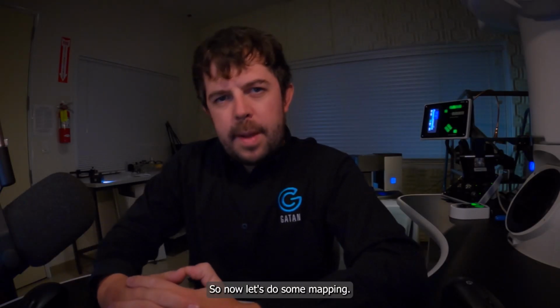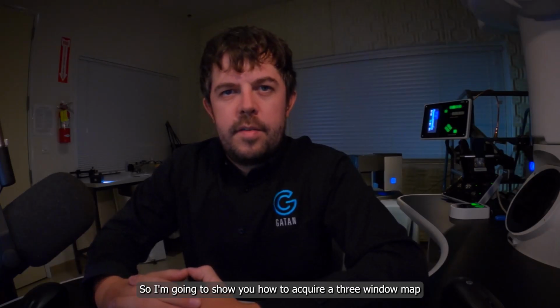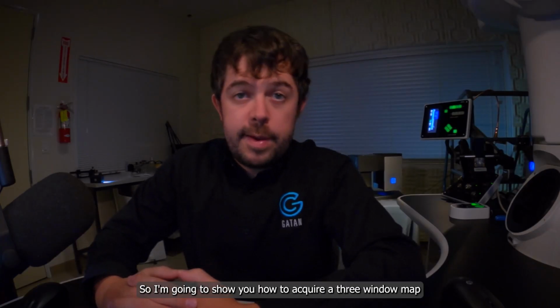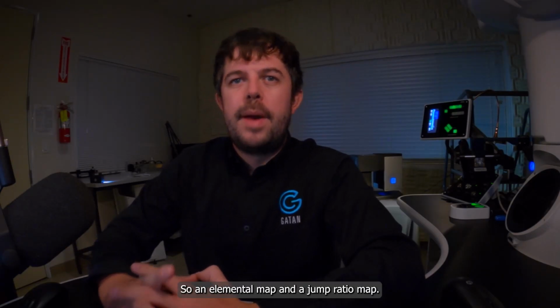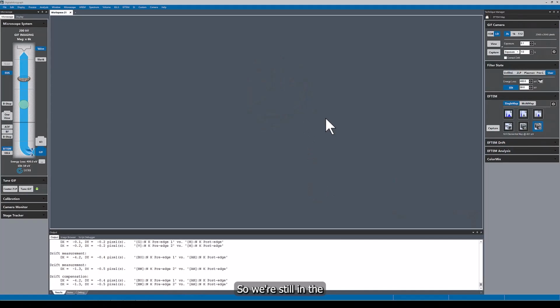So now let's do some mapping. I'm going to show you how to acquire a 3-window map and a 2-window map, so an elemental map and a jump ratio map. We're still in the EFTEM technique. All of the mapping functionality is in the bottom row of this EFTEM palette.